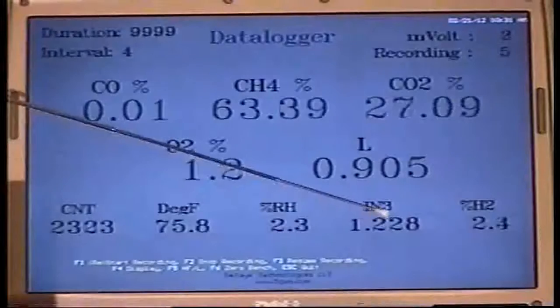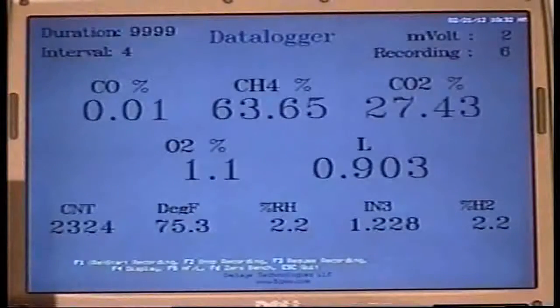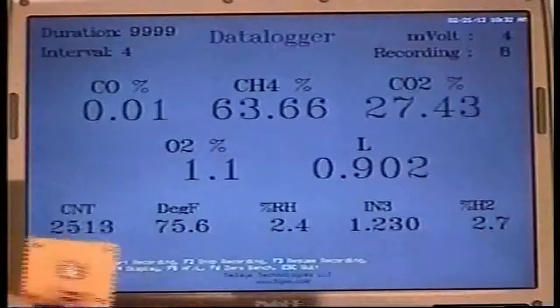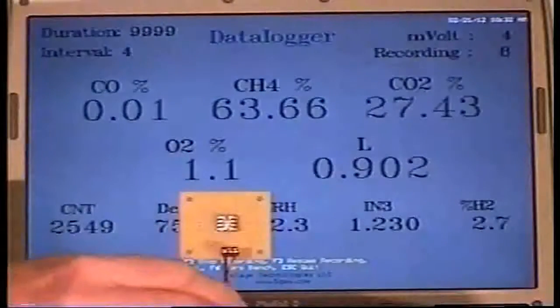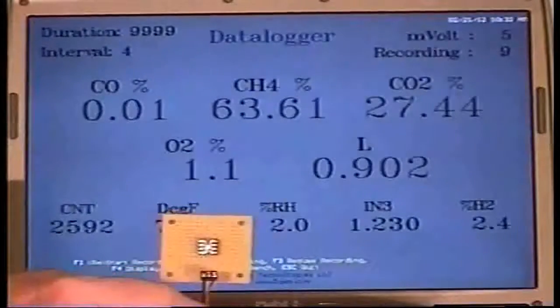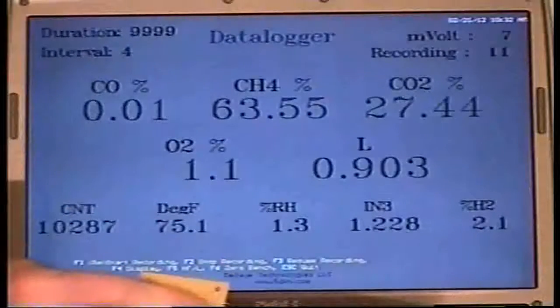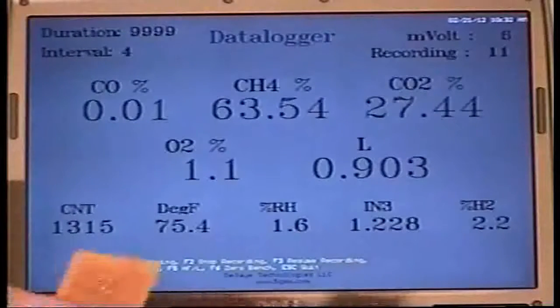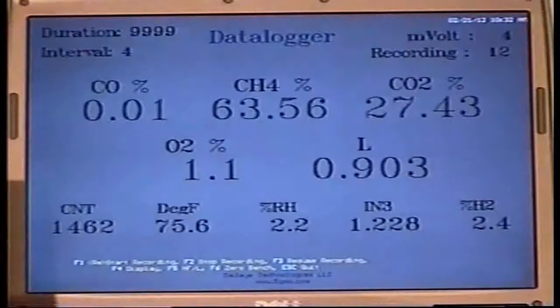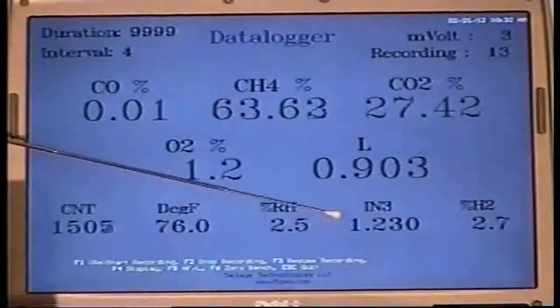We also have inputs down here on our expansion ports. This one down here in the corner is a frequency counter. I've got this hooked up to a light to frequency sensor, and as you can see, it's giving us an indication of the light level that's in here. And if I cover it off, why, it drops. So we also have a temperature sensor here, and this input is connected to a battery.